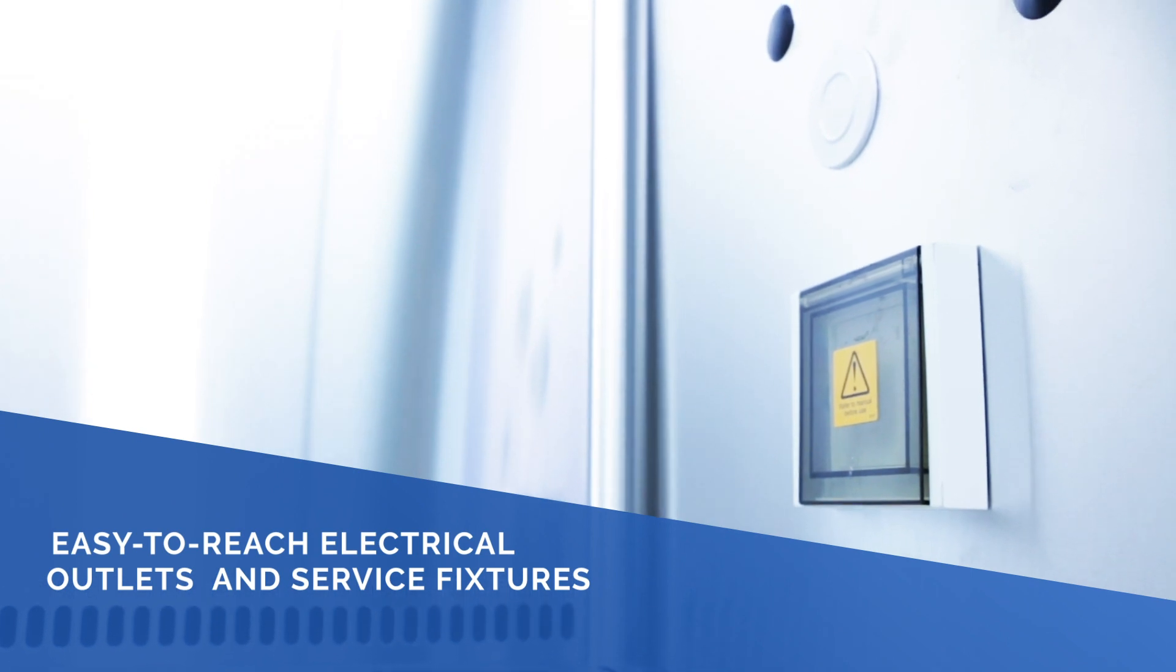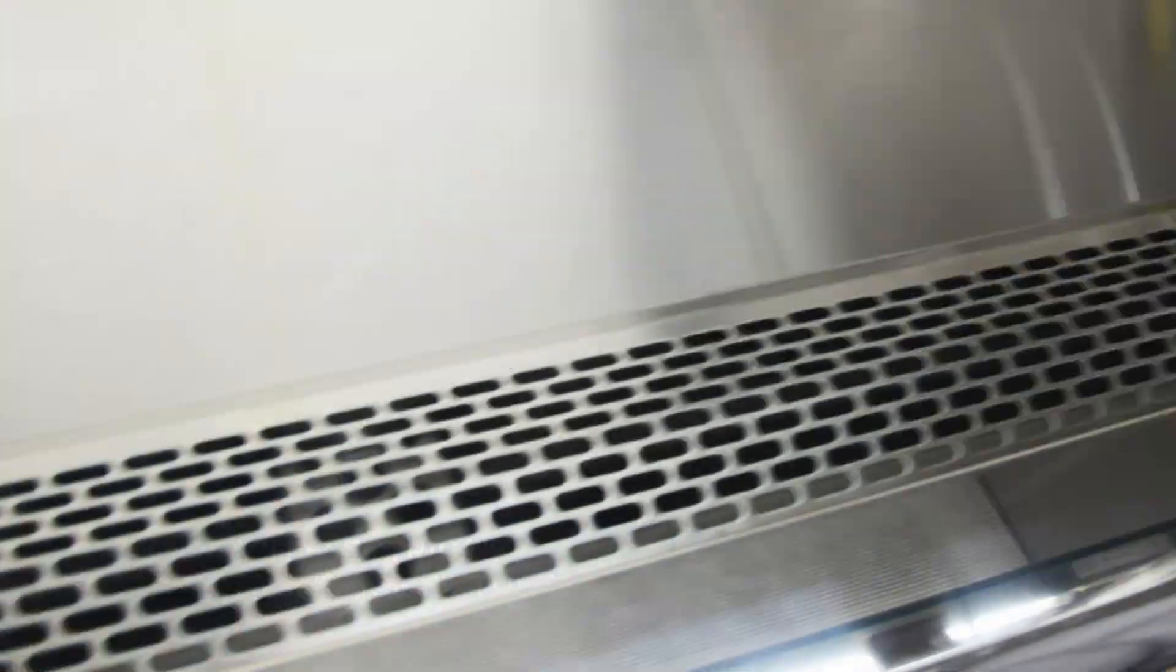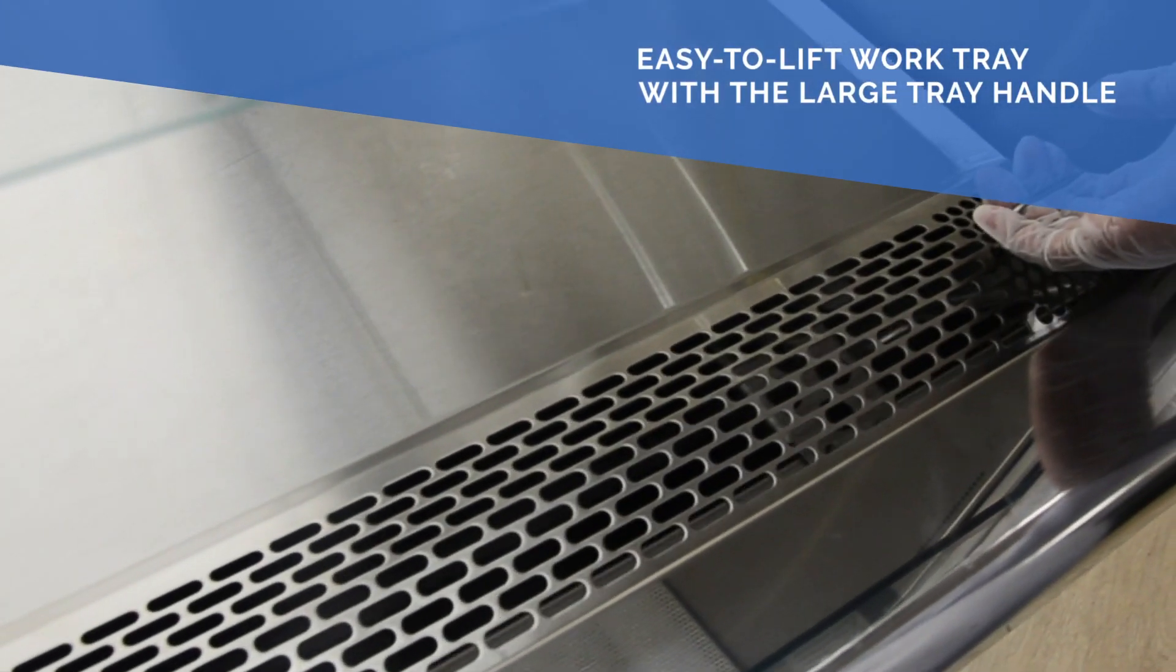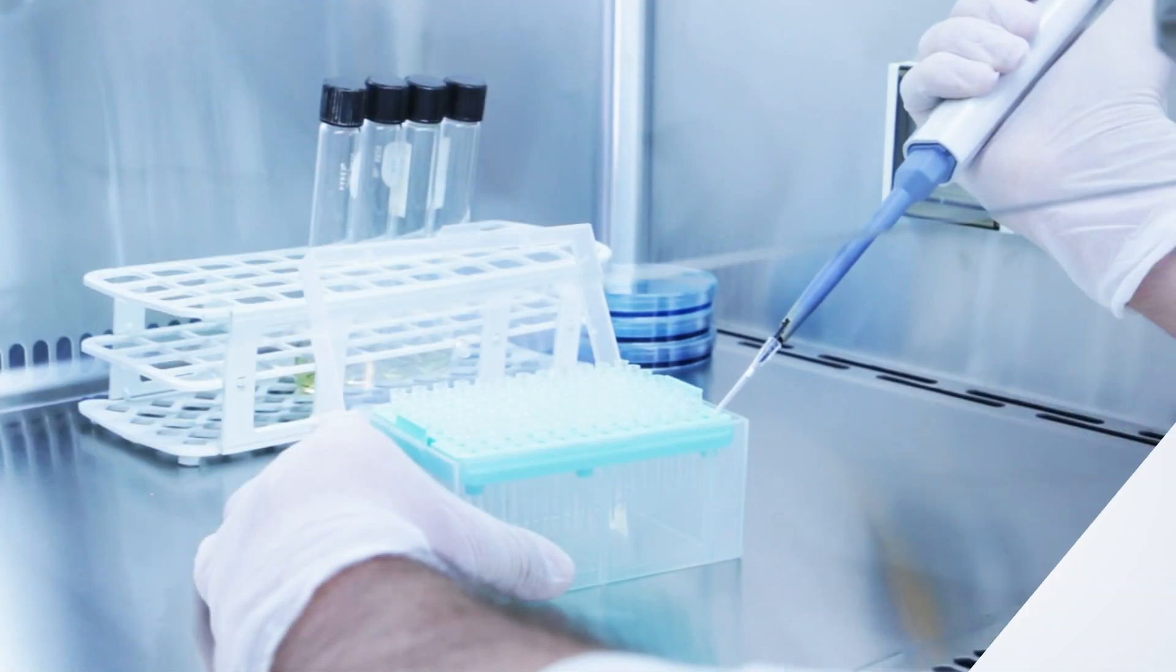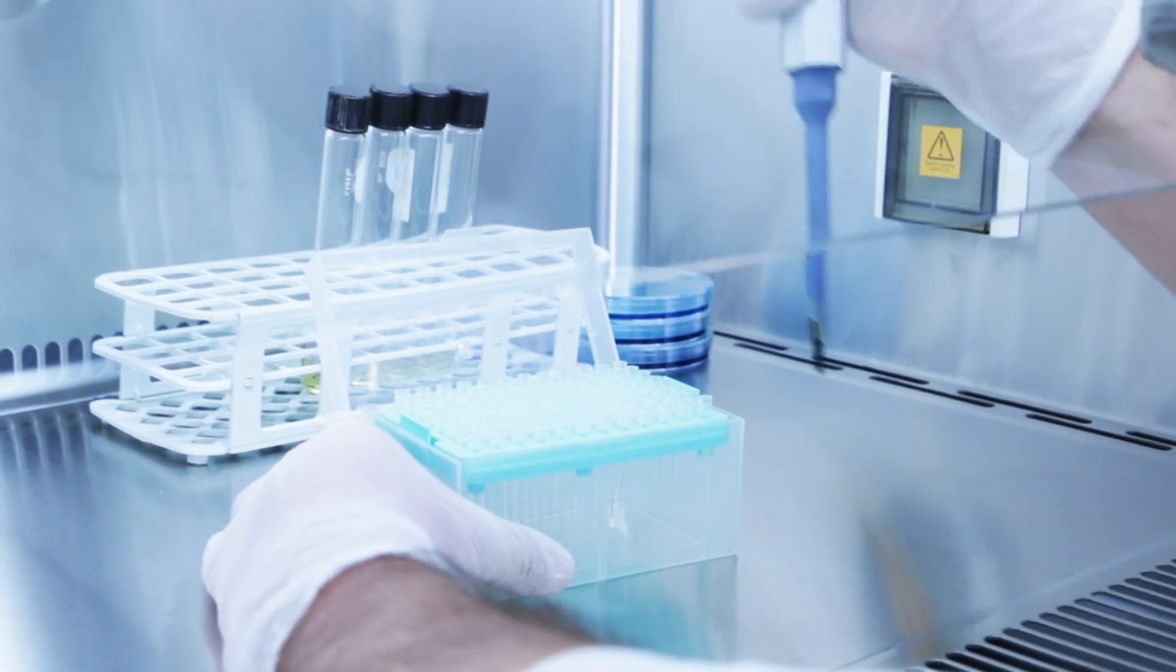Work zone with easy to reach electrical outlets and service fixtures. Hassle-free lifting of your work tray using the large tray handle and removable paper catch where the optional pre-filter can be installed.